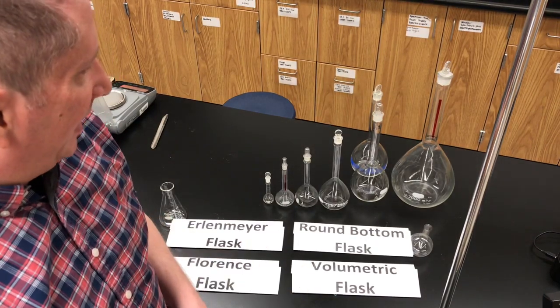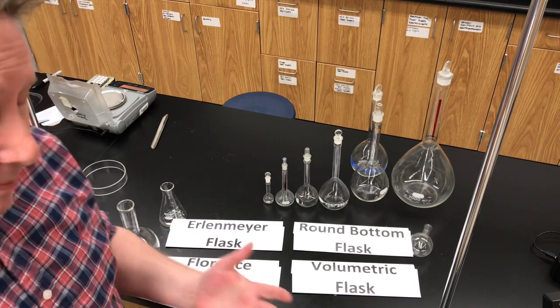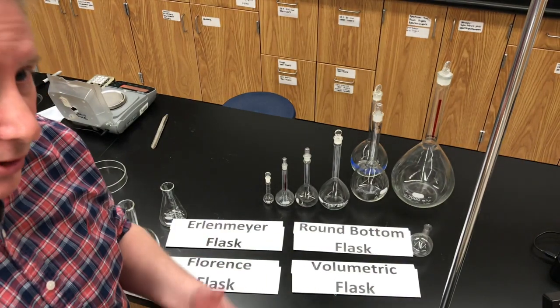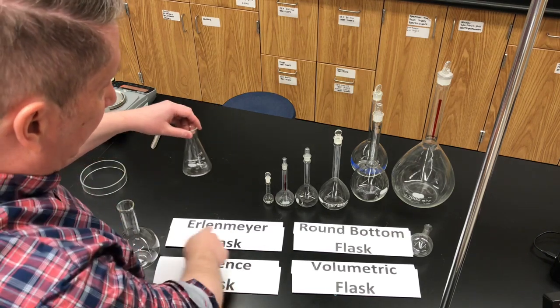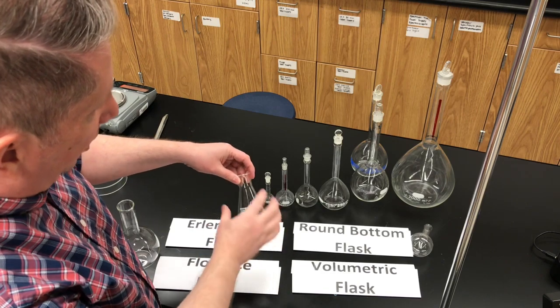There are very many different types of flasks that are used in the chemistry lab. We're going to be making solutions, and one of the flasks we're going to talk about today is used for making solutions. Perhaps the most common flask used in the lab is the Erlenmeyer flask. It has this classic cone shape — conical shape.